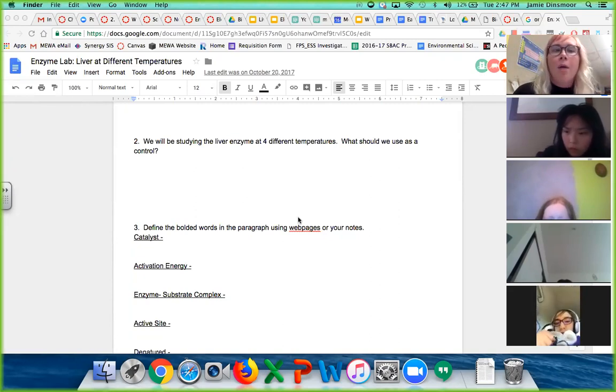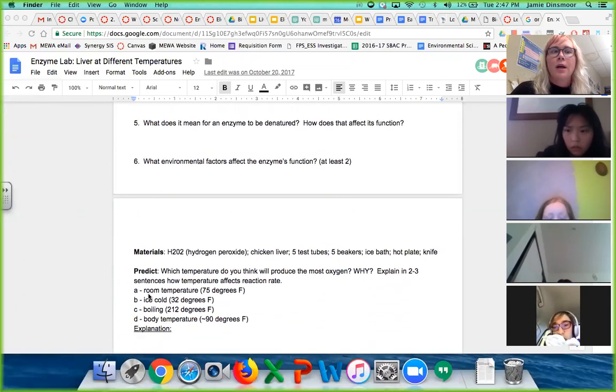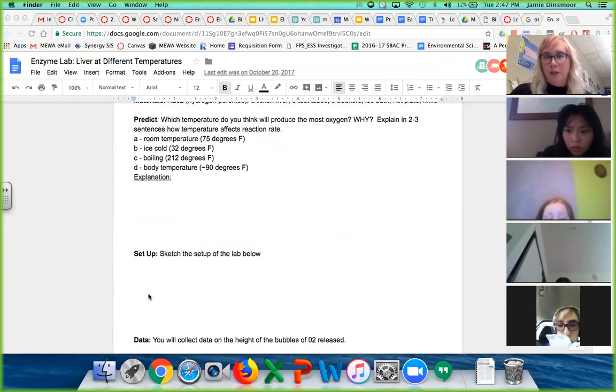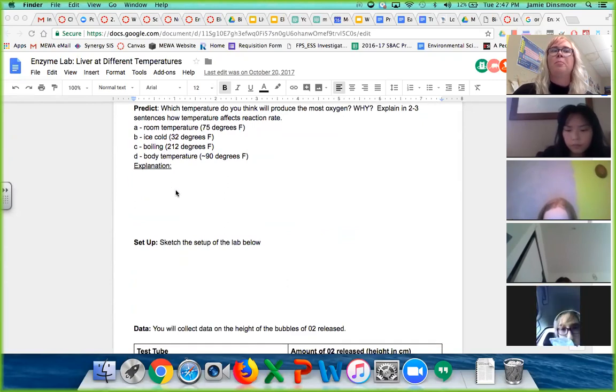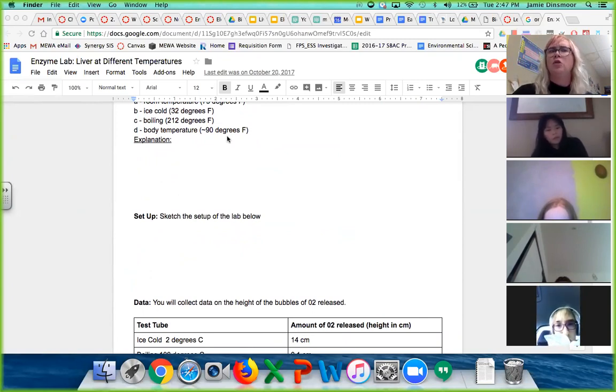All right. So what I want you guys to do right now is predict which temperature you think is going to produce the most oxygen and why. You can just bold one of these choices and then next to it write your reasoning. For body temperature, we're actually going to probably get a little warmer. Actually, I think chickens are a little warmer than humans in terms of body temperature, so we'll be pretty close to actual chicken body temperature.